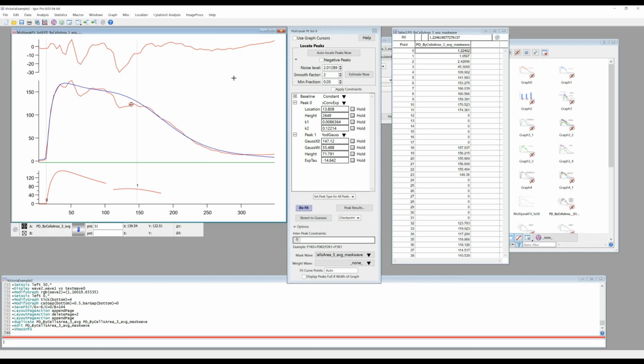What you just saw was an application of fitting to correct for these dips in the experimental curve. And for that we used this multi-peak fit procedure. In order to obtain a certain shape which would resemble a real stress granule assembly and disassembly process, we had to restrict the number of peaks to 2, which resulted in a little bit of sacrifice in the accuracy of fitting.